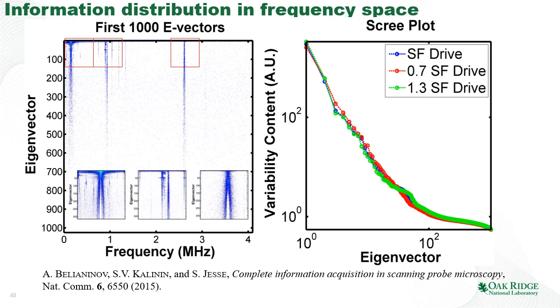the image would be very sensitive to the detailed tuning of the microscope. And it turns out that this behavior is very well reflected in the G-mode. So if the technique has 2 or 3 relevant loadings and eigenvectors, this technique is robust. If there are 100, this technique would be very sensitive to the experimental parameters.